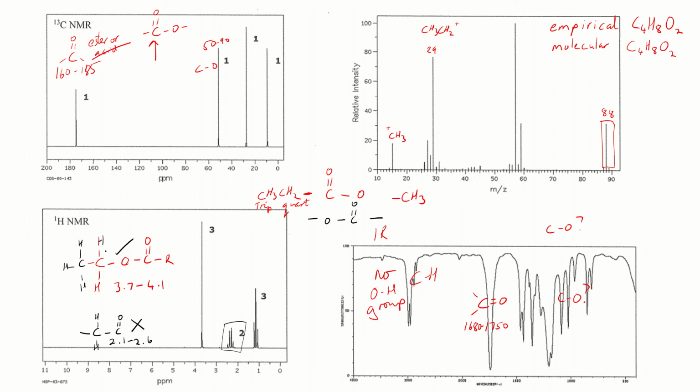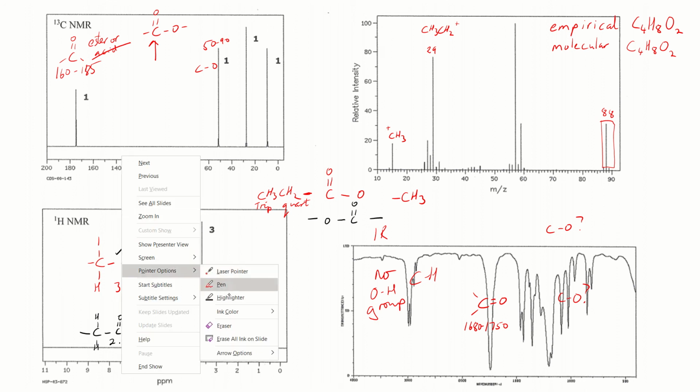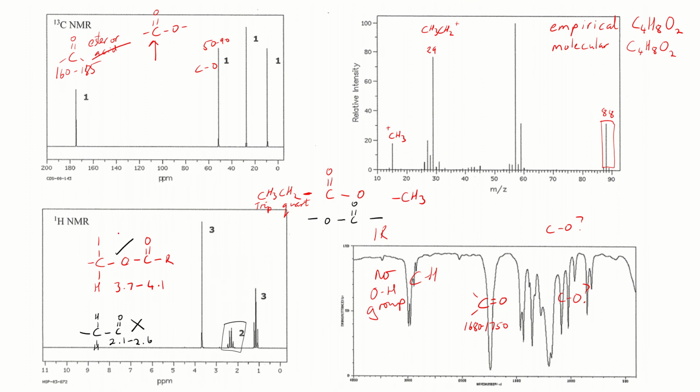But again, it's not, so I'm just going to quickly go back to the structure we had. So my methyl propanoate is the correct structure.